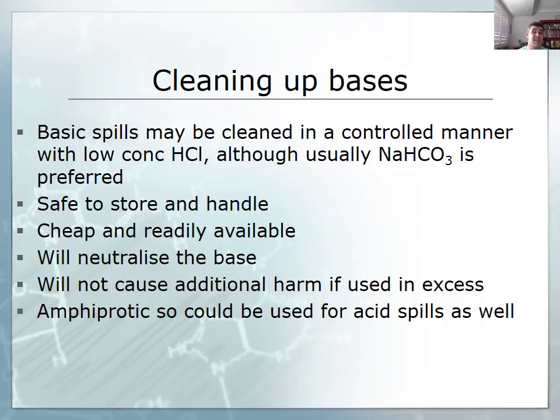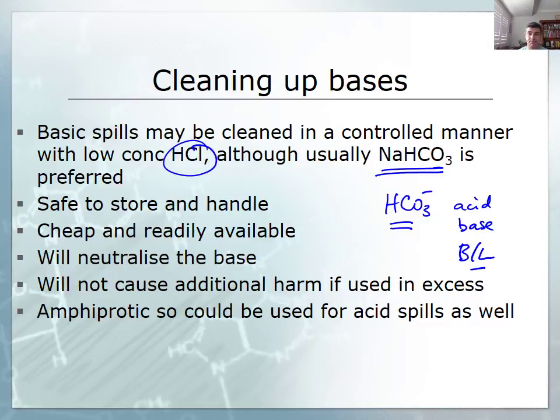When we're cleaning up bases, we use effectively the conjugate acid of the carbonate ion. So in this case, the bicarbonate ion. So we know that the HCO3- ion can act as both an acid or a base, according to the Bronsted-Lowry definition. And so it's a good one to use for the neutralization of acids, but can also be used for neutralizing basic solutions.